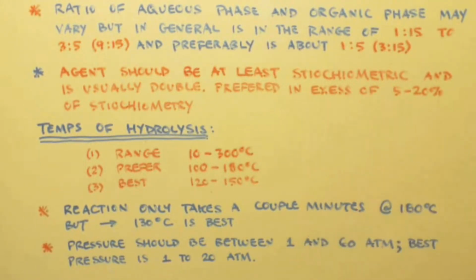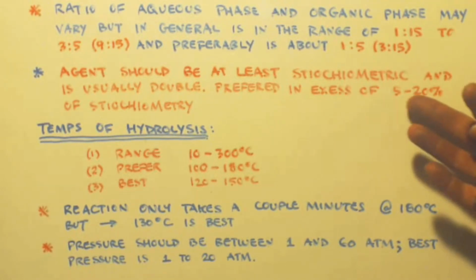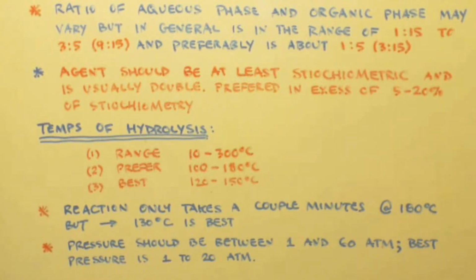But it's preferred to be in excess between 5 and 20% of stoichiometry. So if you have a mole of chlorine you need to get off, I would suggest a mole and 10% of a mole, because that's in between this. A mole and 10% of a mole of hydrolyzing agent. That way you have 10% in excess.